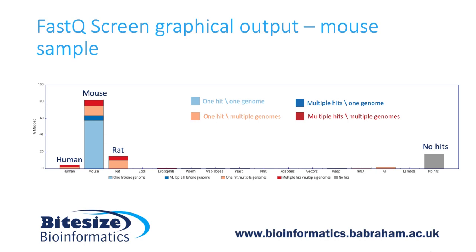Interestingly, these reads that multi-map to the mouse and other mammalian genomes do not appear to map to other species, such as Arabidopsis or Drosophila and so on. So, these results are strongly suggestive that we have indeed sequenced mouse DNA and everything looks as it should.